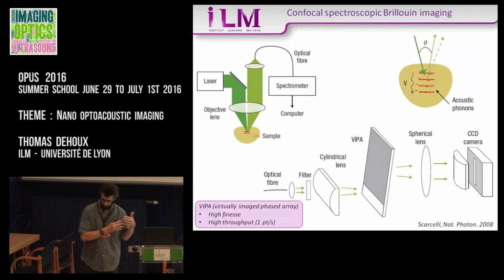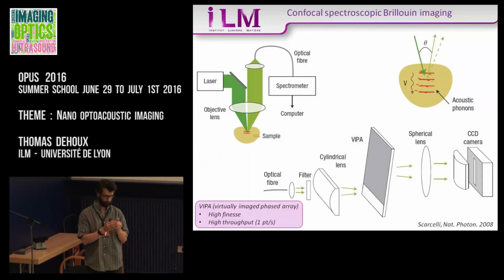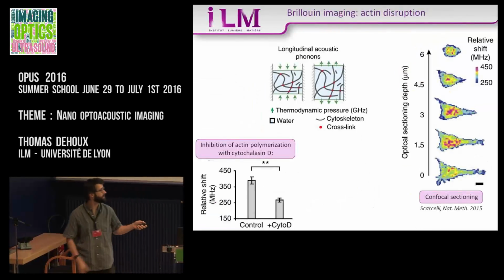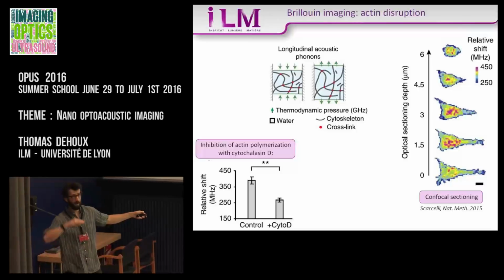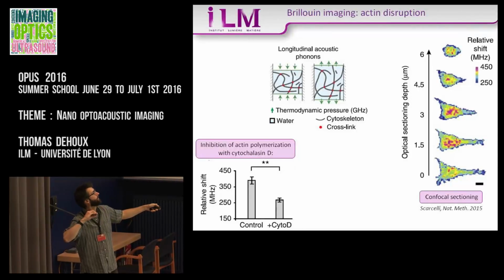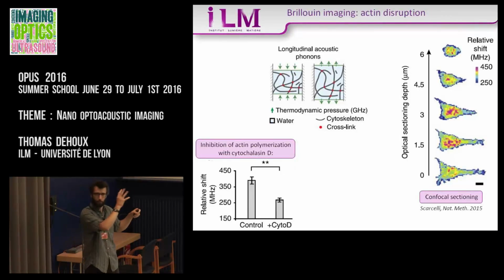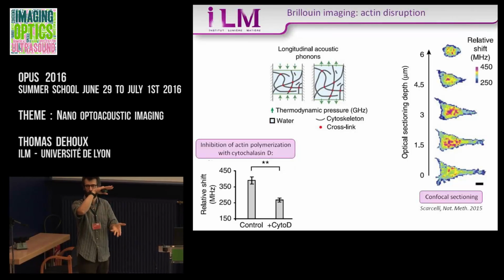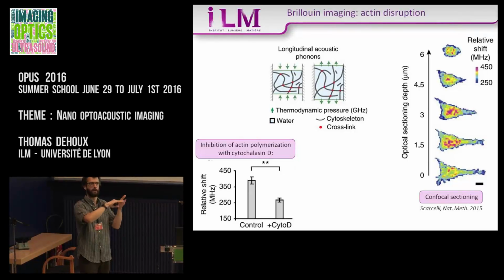And they send it into a confocal microscope and do confocal sectioning. They obtain such images here, where they have different planes at a spacing of about 1.5 microns. This is the first drawback: the confocal sectioning has a lesser resolution than in the time domain.